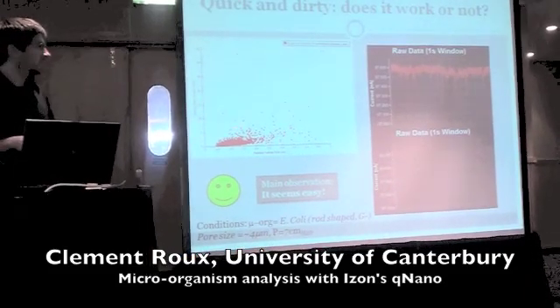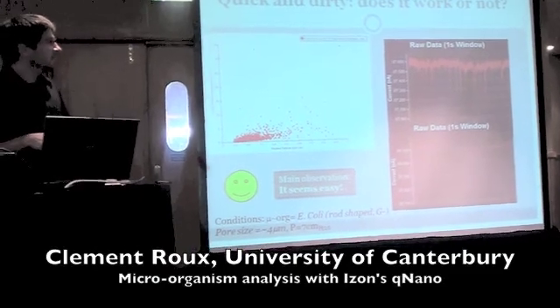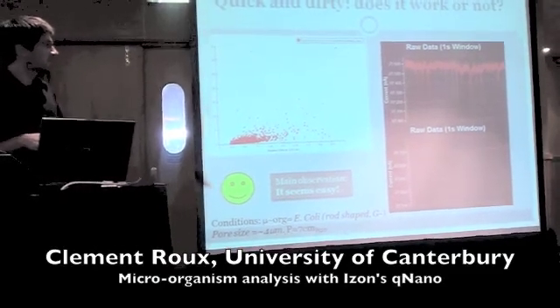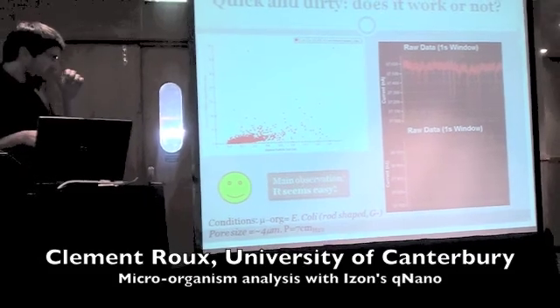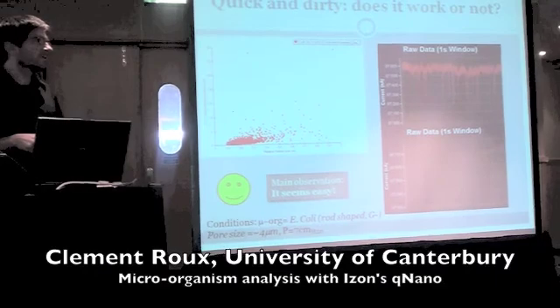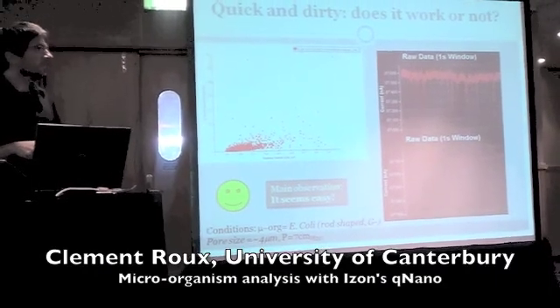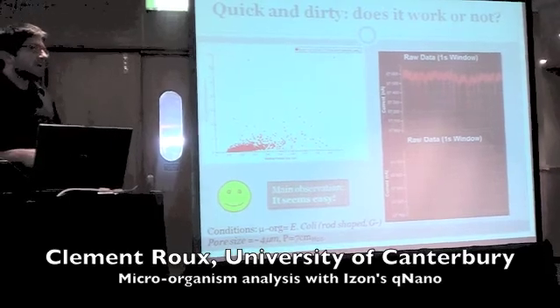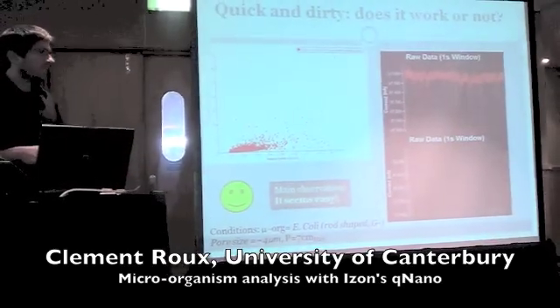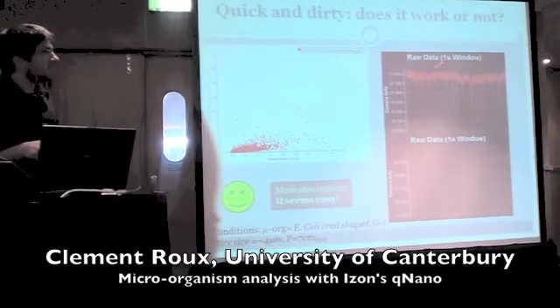I was not the first person to do this. Sam actually did it way before me. It was kind of straightforward for me to actually manage it. You don't need to try 1,000 different conditions. Basically, you just put your bacterial suspension on top of the nanopore, apply some pressure because we noticed that you can never get blockades without pressure, and you see billions of blockades.